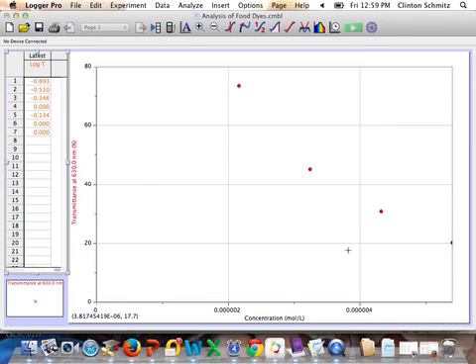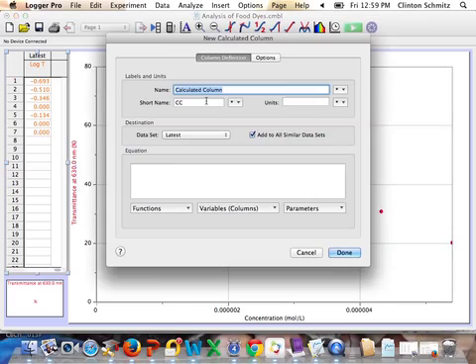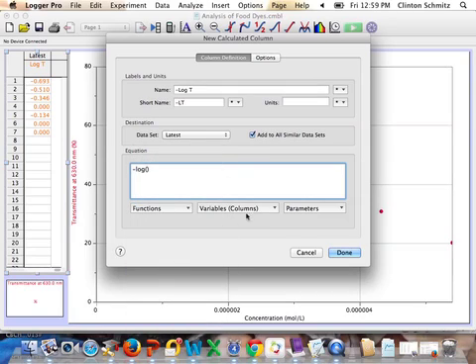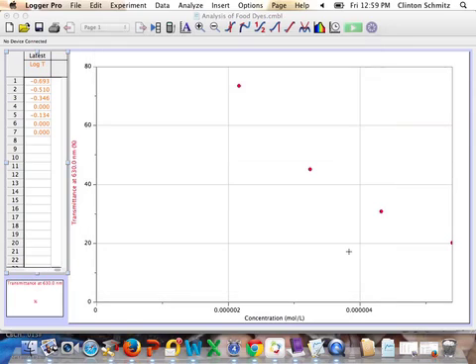Alright, so that's done. And then the last one we want to do is negative log transmittance. So we'll call that negative log T, negative LT. We'll go negative, pick your function again. Once again, it'll be a log. Then we have to pick the variable that we want in there, and it will be the transmittance. And we'll hit done.